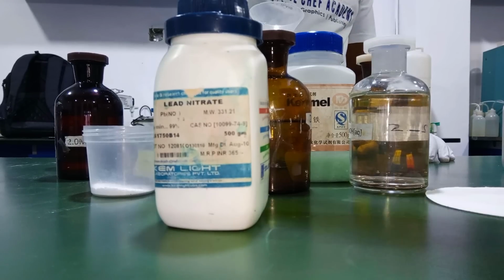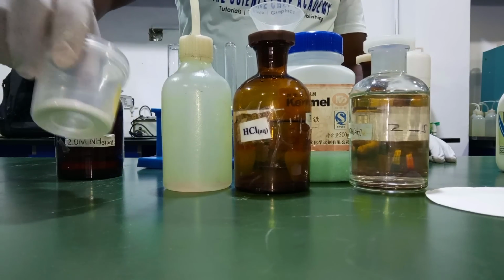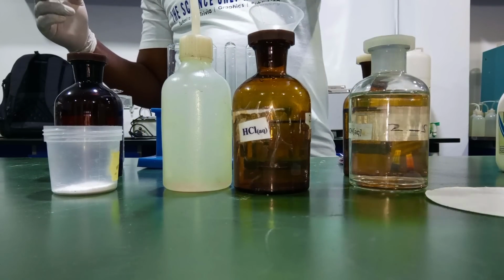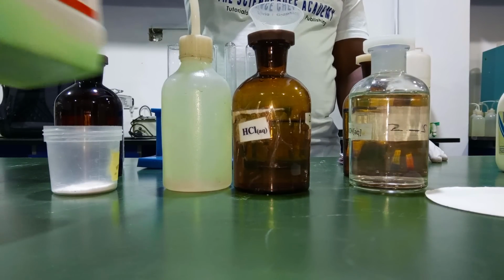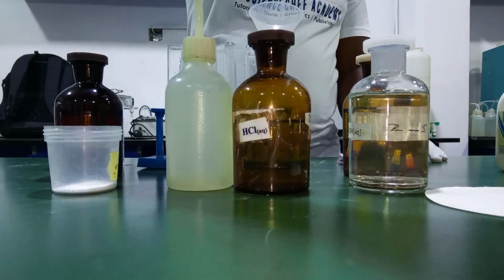Good. So now this is a mixture of the two salts. You can see the white mixture. Both of them are white salts. Then we have here iron(II) tetraoxosulfate(VI), which we are going to use to prepare freshly prepared iron(II) tetraoxosulfate(VI) solution. That is freshly prepared FeSO4 solution.